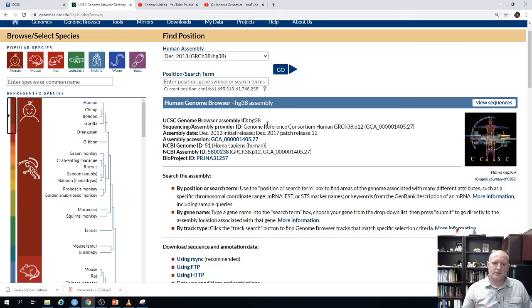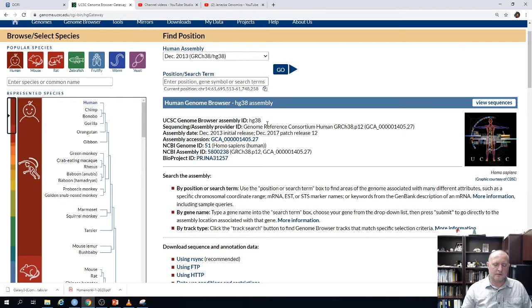When an assembly of a genome is first put together, it's the first version. Over time, as there's more sequencing data and additional information on how those sequences should be ordered on a chromosome, maybe some gaps are filled in, and new versions are produced. The coordinates of where the genes and features are located get updated. So it's important that when comparing your data to a previous study or another dataset, you make sure you're working off of the correct assembly version.